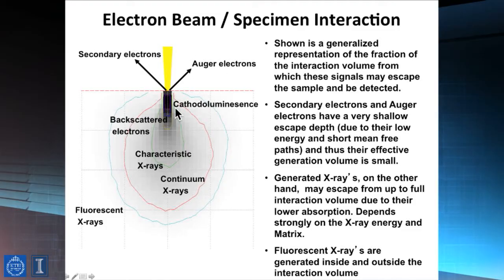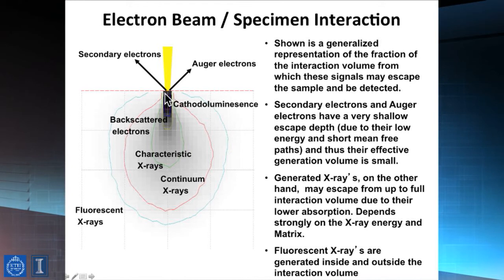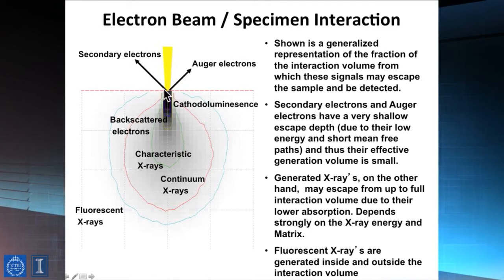And what you notice is that there are different analytical depths associated with it. Auger electrons, as we mentioned, are very surface sensitive. Secondary electrons, because they're relatively low kinetic energy electrons, have very high spatial localization towards the interface of the material, right? So that, although not a surface analytical attribute that allows us to determine compositional information, because we're not energy analyzing the electrons in this case, we're just looking at these low kinetic energy electrons that actually manage to emerge from the sample where they can be detected at a detector.